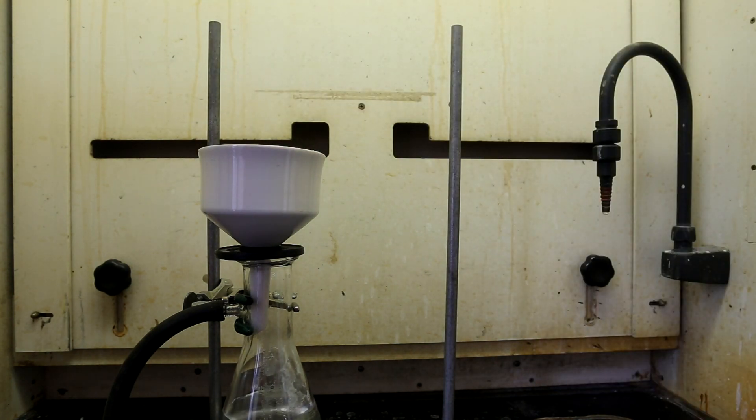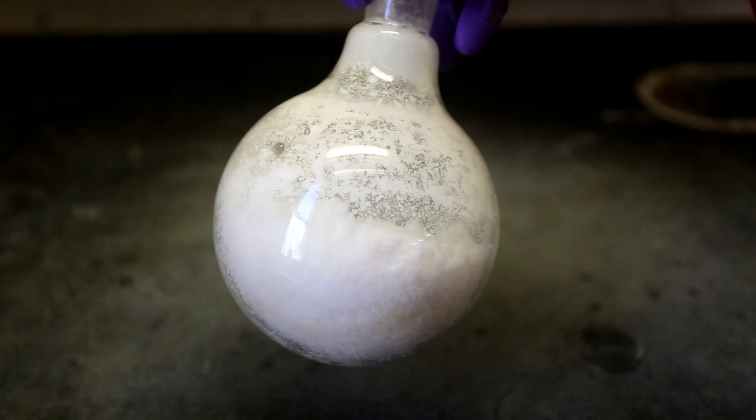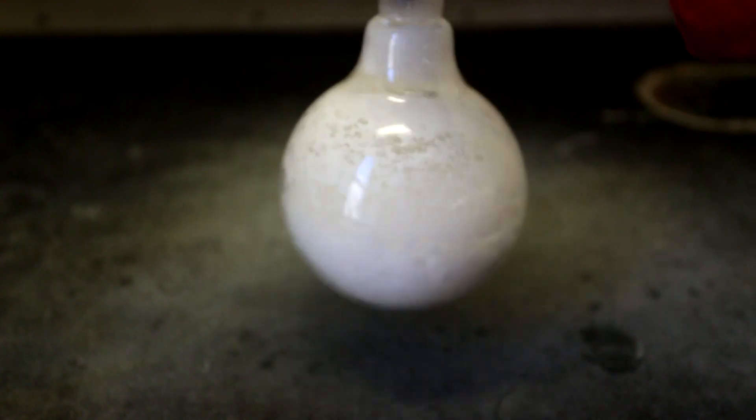I had access to a rotovap, so I transferred the solution to a round bottom flask and evaporated all of the acetone. This is the final product after drying in an oven overnight. The final yield was 94%.